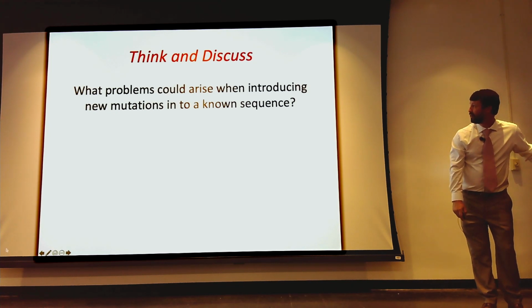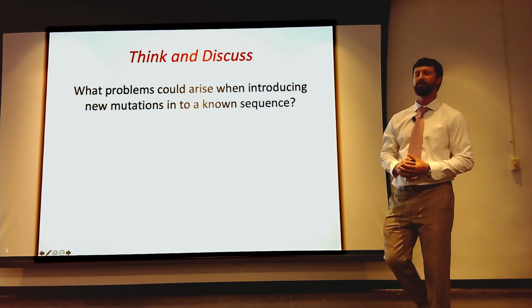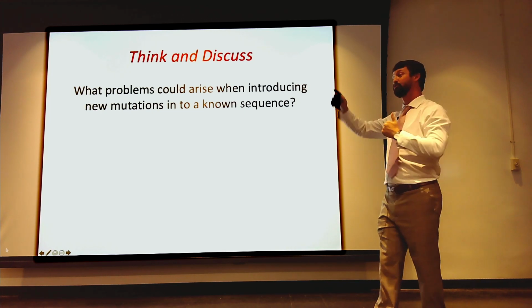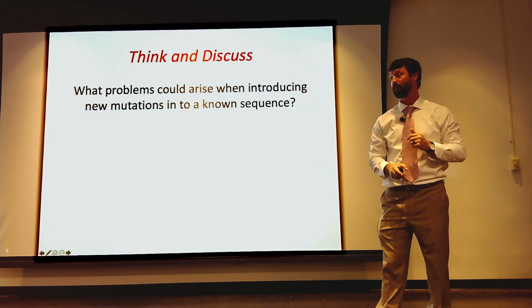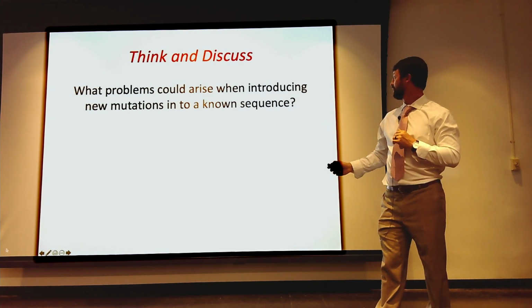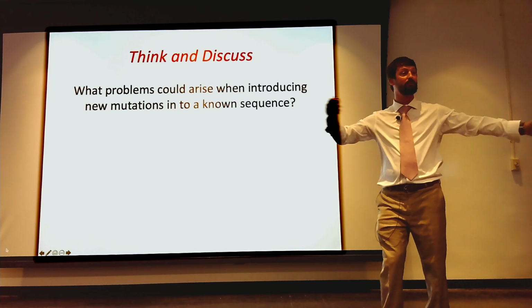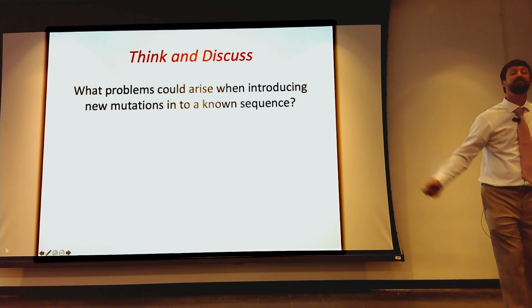All right. So, what problems can happen when you go to make a mutant protein, right? Well, step one is design your primer, right? I would actually introduce step 0 is look to see if the protein has some structural properties already determined. Look at the protein and see where the mutation you're making, right? And see what it would do. Then look at your primer. You got to make your primer, right? Primer could bind to itself. Primer might be too long and adopt too many other secondary structures. The primer might have multiple sites that it finds on the plasmid.